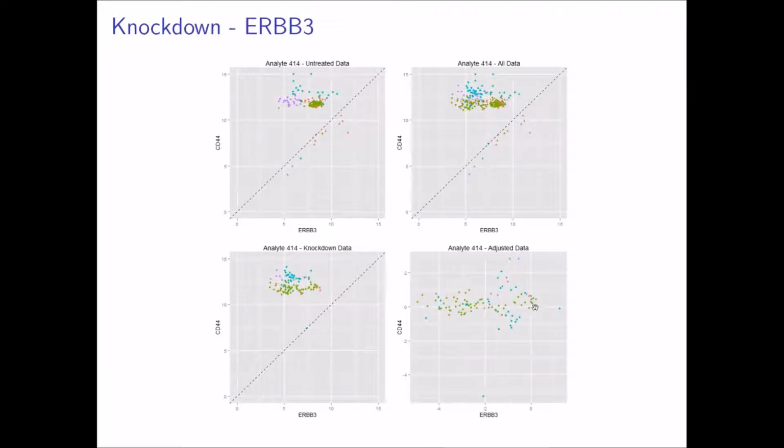So it does look like this gene is knocked down. The vertical is not as much signal, which we don't necessarily expect. Again, it's not the same gene. But again, this is encouraging in seeing that, in this case, the knockdown does appear to be doing something.